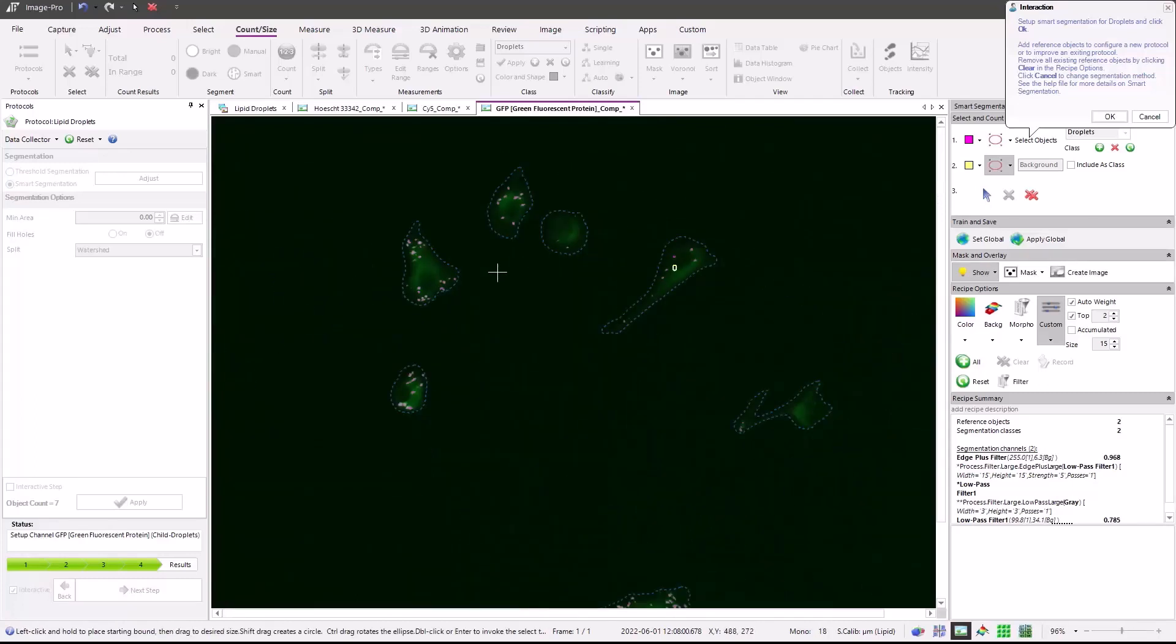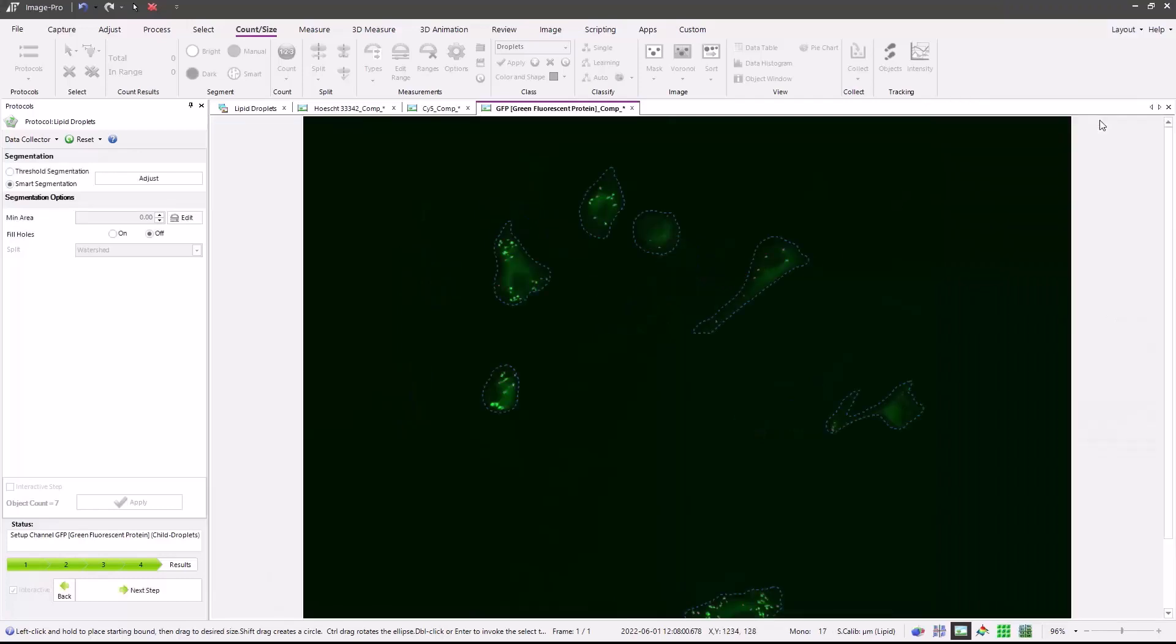And this protocol is important in that to be considered positive for having the lipid droplets, it must include at least three. Now that I'm satisfied, I'll press the OK button. Segmentation options are available for filtering out small areas of fluorescence or large. Object splitting and fill holes are also available.